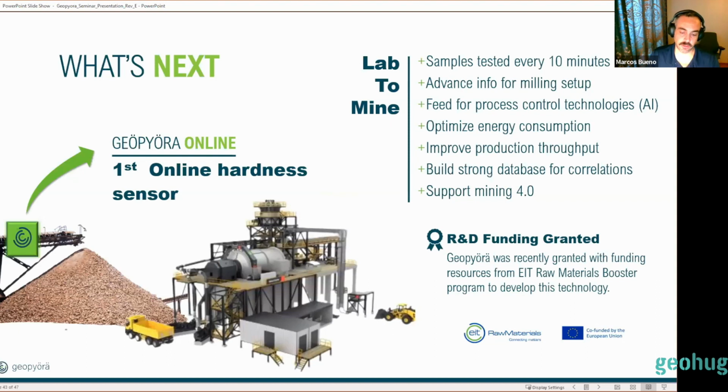And another technological development I briefly mentioned in the beginning of the seminar is online testing. Some customers want to bring our technology to the plant, to use it as a sensor, to measure samples every 10 minutes, in real time, and generate data for process optimization, basically creating an online geometallurgical lab, because we can do mineralogy on the product of the breakage test too. Then we push this knowledge that we generate in the processing plant upstream to the geological model, and we also have data to optimize the process downstream.